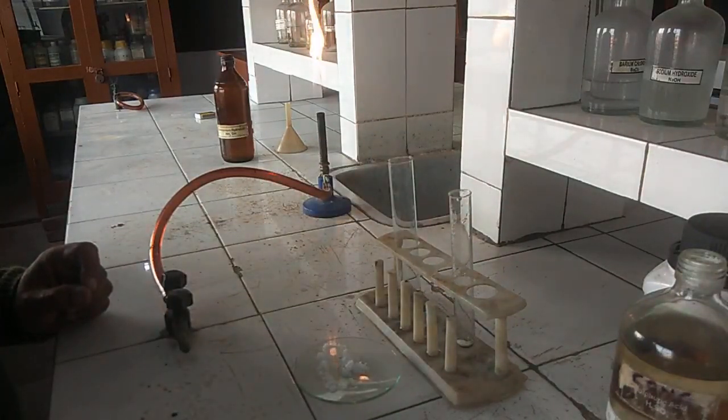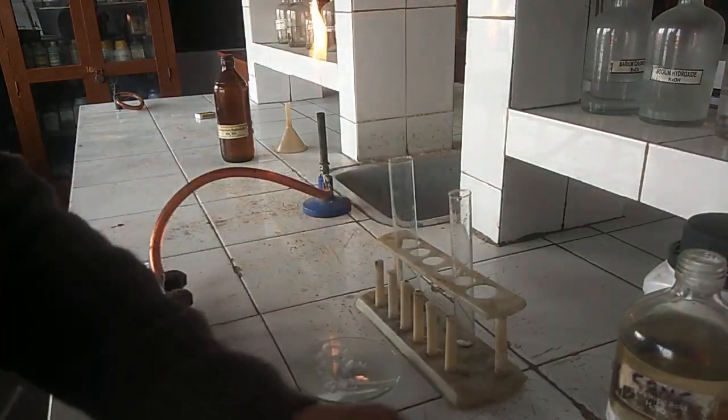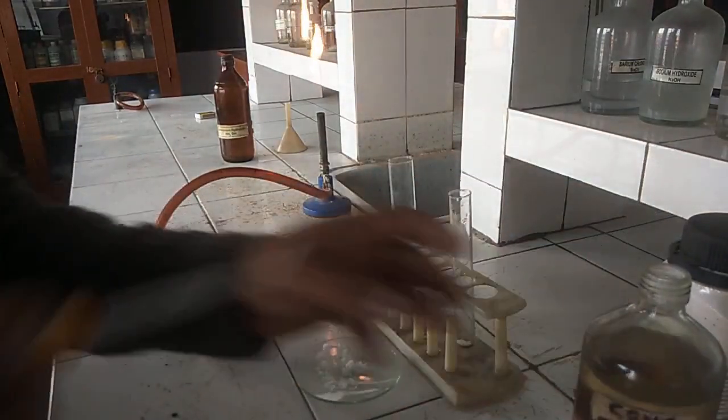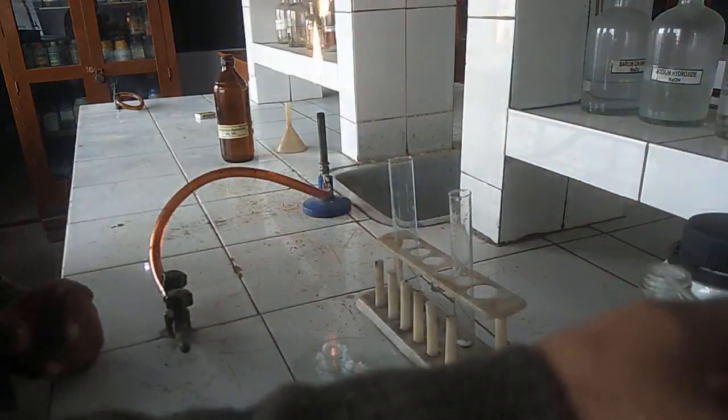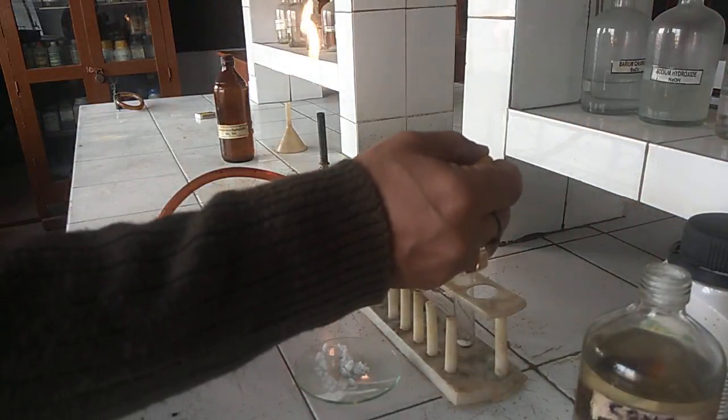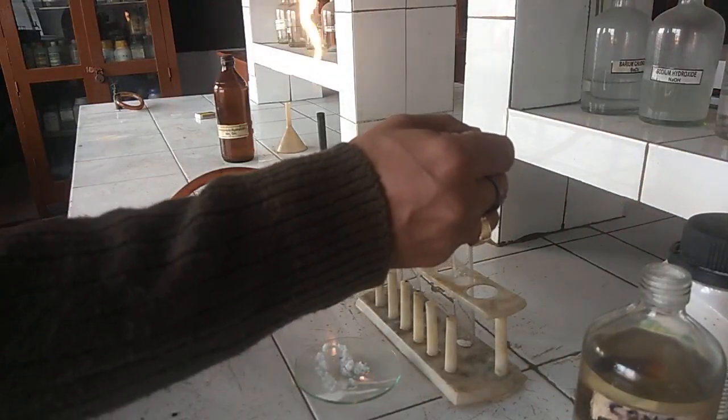Now we will add concentrated sulfuric acid to this with the help of a dropper. Dropwise we will add this concentrated sulfuric acid to the salt.